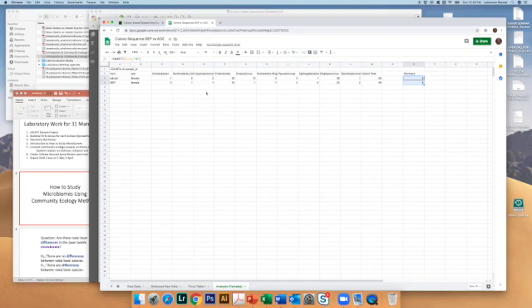I would make another little table, and you can do that by, we'll just pick up these values, the identifiers. I'm giving a copy command, and then I'm just going to go down and say paste those in. There they are. And then we can just identify those genera that we're interested in. So Enterobacter and Enterococcus, I'm just highlighting them and giving a copy command. And then we'll just paste them in here. And then Staphylococcus, I'm giving a copy command and pasting it in here.